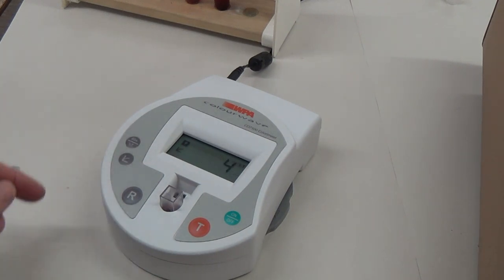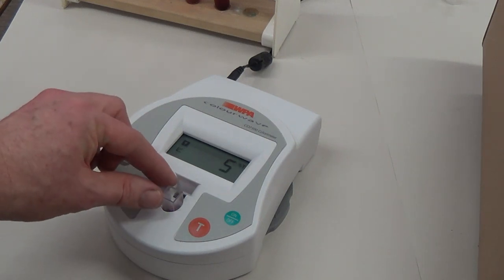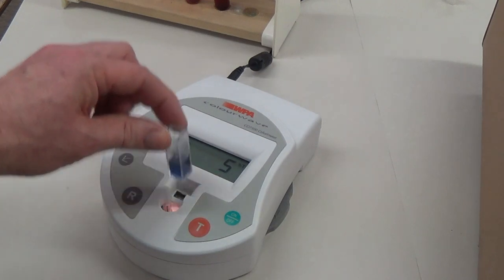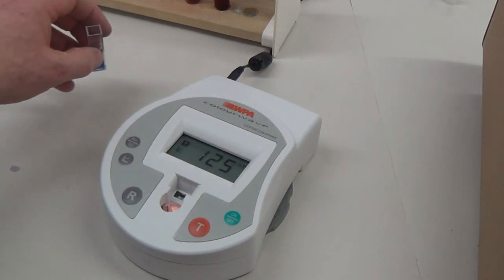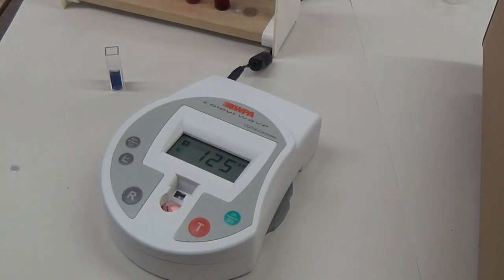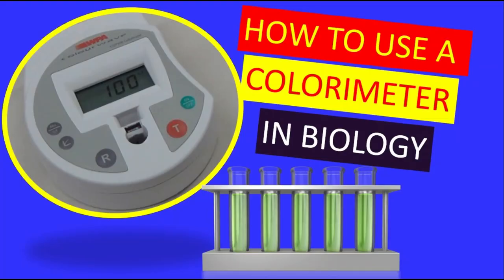I'm going to do percentage transmission here. You'll be able to see the change in percentage transmission. There we go. There we have the colorimeter.